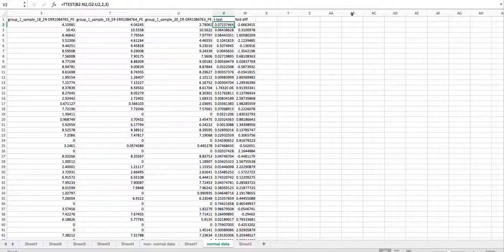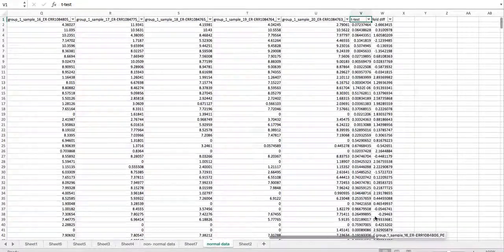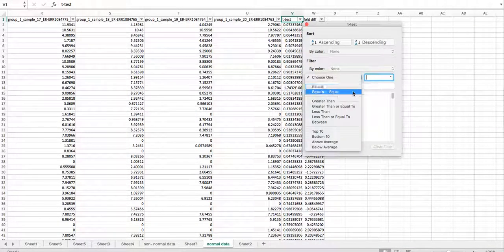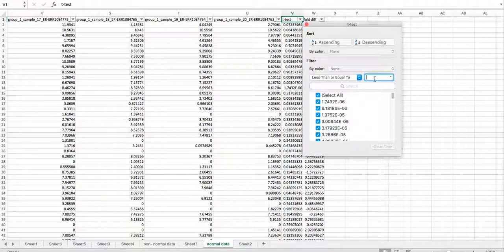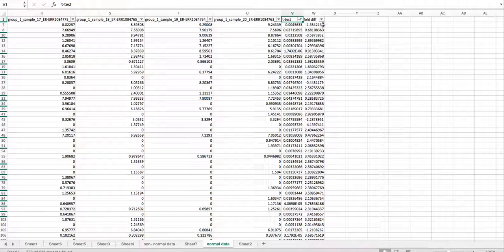We hit Filter, drop that down, and we want values less than or equal to 0.05. It will filter out those — as you can see it changed — that have a p-value of less than or equal to 0.05.